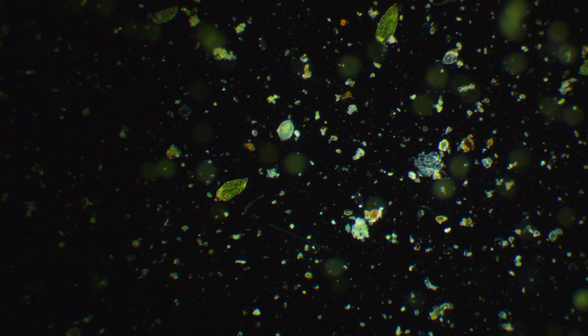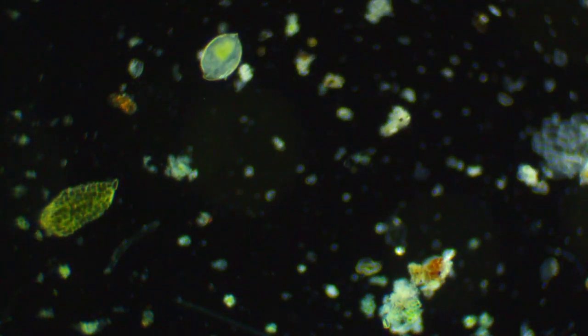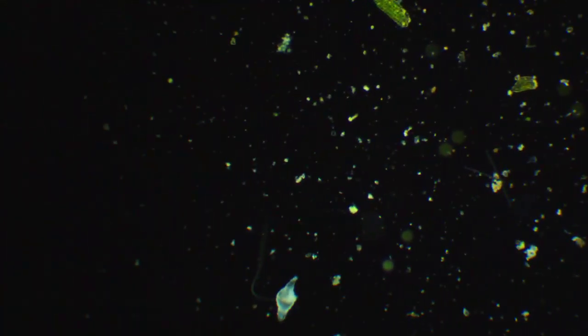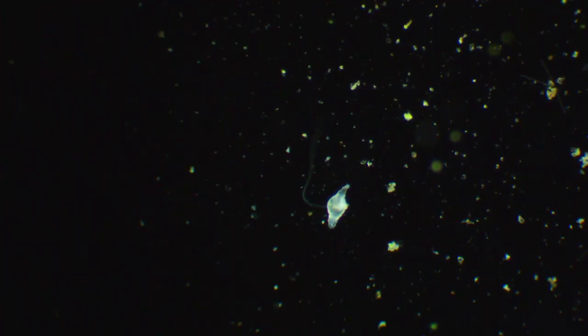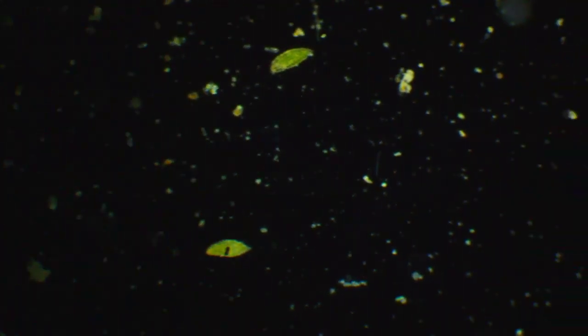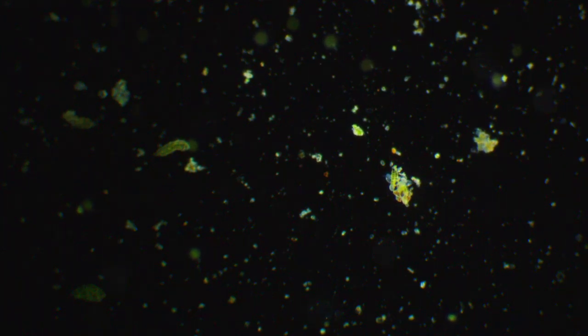That thing looks like something. Kind of obscured by something too. It's tough to see him. Another dead rotifer, looks like. He got fat before he died, at least. Maybe that's why he died. He got too fat. It can happen. Just saying. Another rotifer, a small one, with stuff on his back.